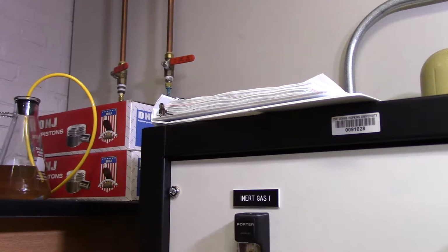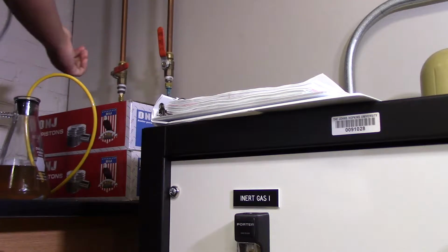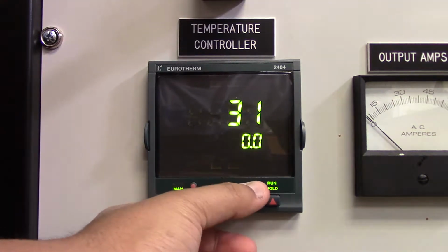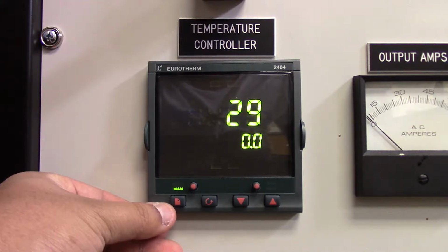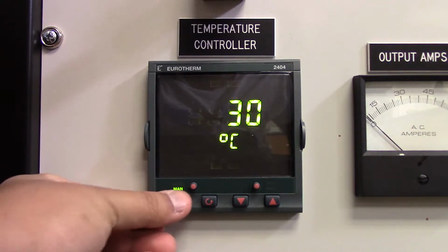So, before any operation, we need to make sure that the cold water supply is in the on position. To set it to manual usage, let's toggle this to manual and hold this button here until hold and run both turn off. So now we're in the main menu for the furnace, and we can scroll through these menus to edit or run programs by pressing this menu button here. That essentially just looks like a piece of paper with its corner folded over.